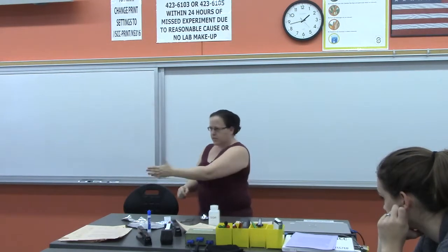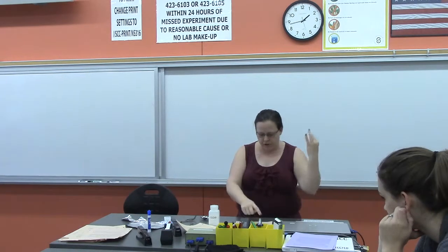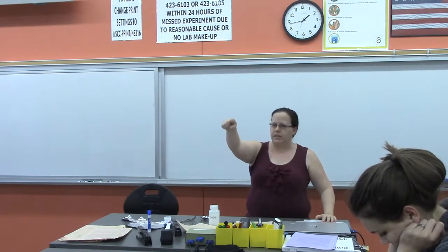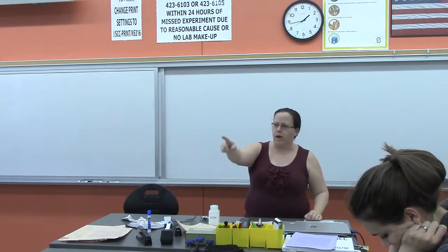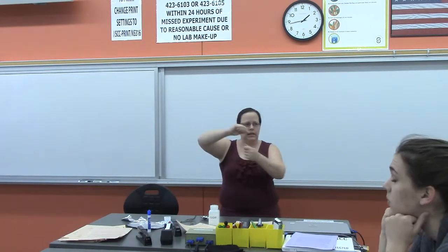For each of those substances, you're going to have a little square of aluminum foil with that substance on it. You're going to get one with just tap water, one with table salt, one with sugar, one with ethanol, which is alcohol, and one with wax. We have a container in there that just has some little chunks of wax in it. The copper(II) sulfate is the bright blue one that's back there. And then mineral oil is a liquid.